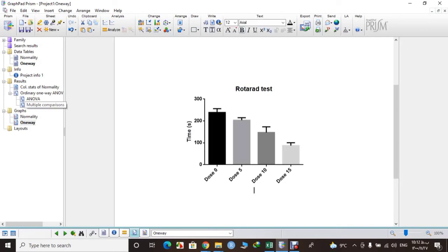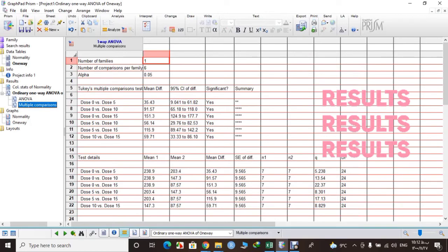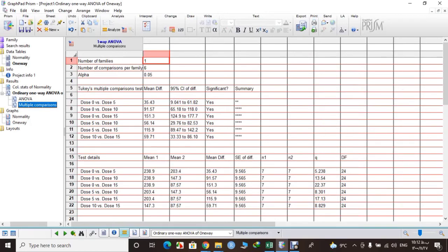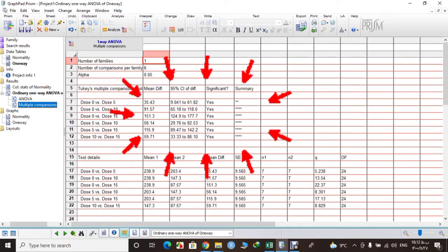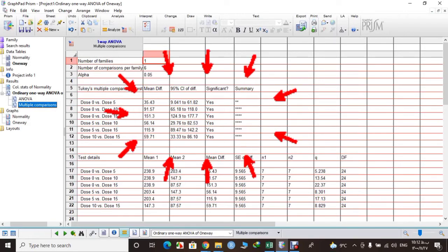If you remember, we wanted to have multiple comparison as well. So let's see if there is any significant difference between our data. Now you can see here that there is difference between our dosages.